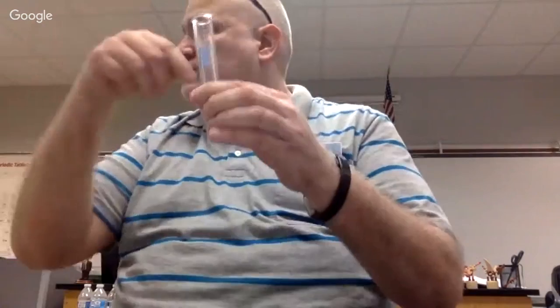Remember this, because when you're doing this step, you're going to add to the 3rd mark, stir. Again, you have to have your stirring rod be clean from the previous steps, right? You're going to stir, move, and then add more, stir, and then add more. Okay. Once you're done, you're going to set this back into your test tube holder.